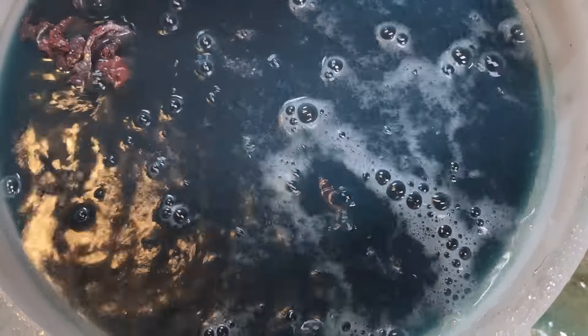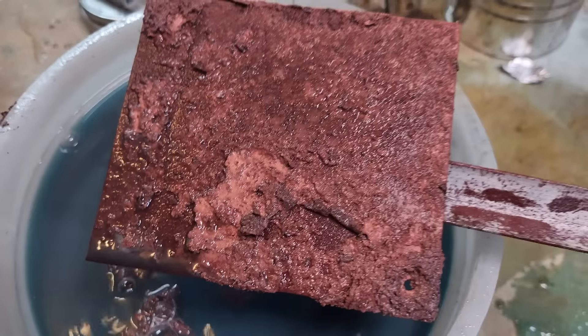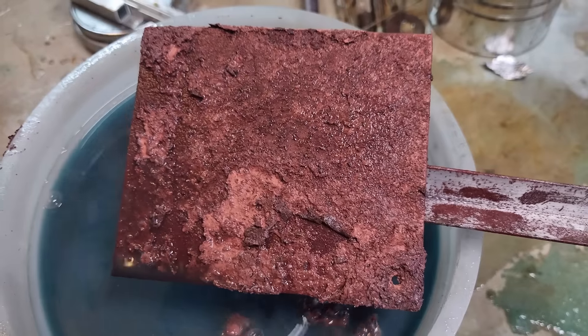Then I threw in some shredded aluminum foil and the scrap plate. Here's a 30x speed time lapse. The dissolving of aluminum happens way faster than iron, finishing in a matter of hours rather than days. After about 20 minutes the bucket was getting hot and bubbling. Here's the scrap plate after just one hour — that's pretty ugly.